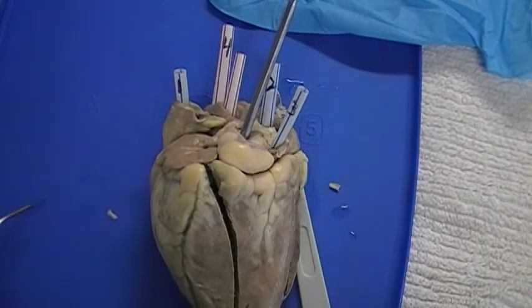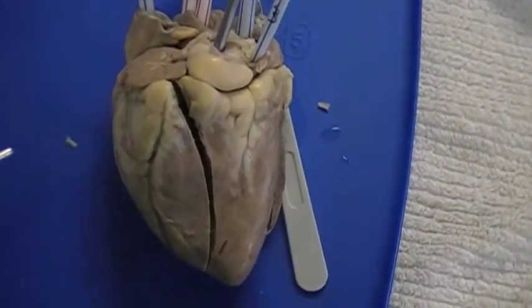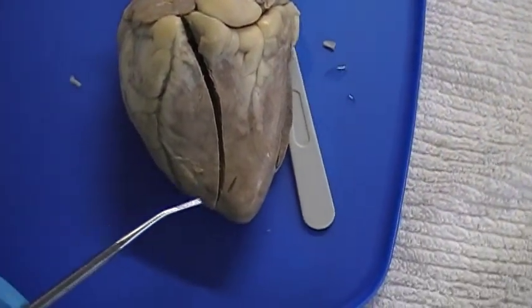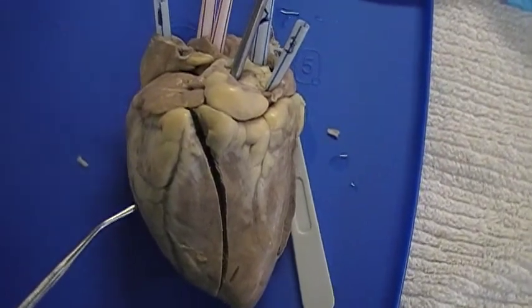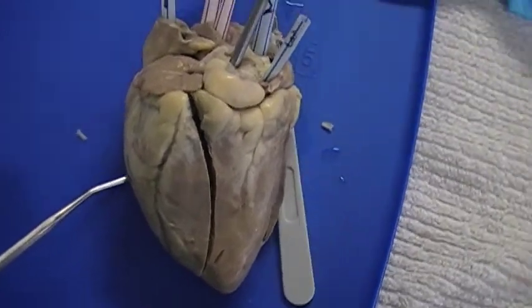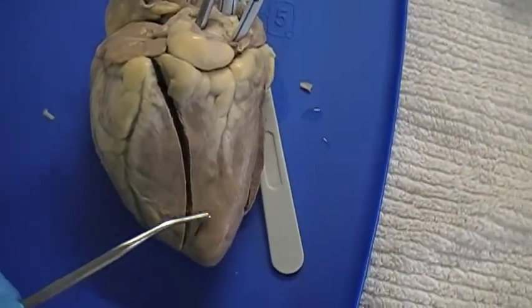So first I'll start off with where the epicardium lies. The epicardium is kind of this fat layer that surrounds the whole heart. It's more of a protectant layer. And then the apex of the heart is the lower point right here.